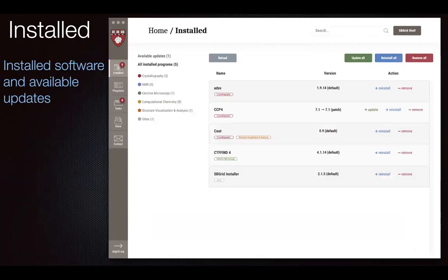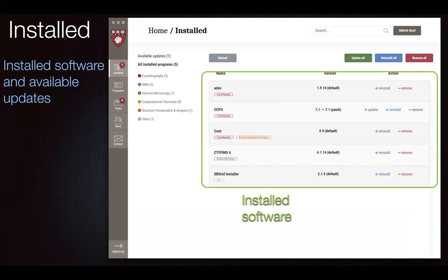All right, so switch down one more. We're just going to go down to the installed screen. So I click the installed button. This is just all the software you have installed so far. If you haven't installed anything, this would be empty. So you can see on this is all the titles that you've installed. On my machine here, I had 5 titles installed.